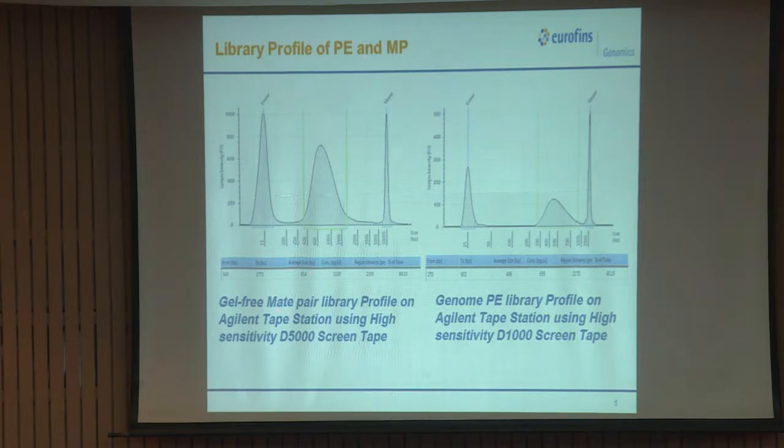814. This is a mate pair library in which it is a bigger library with a longer insert in it, right, long insert. So, if I have longer gaps in my assembly, if I have repetitive region in my assembly, this type of reads can resolve it because it has a gap between it. So, what happens in the assembly? It will consider this 814 minus 120 because 120 is my adapter straightforward. So, that goes off. 814 minus 120, that becomes my sequence insert length in between the two sequences.